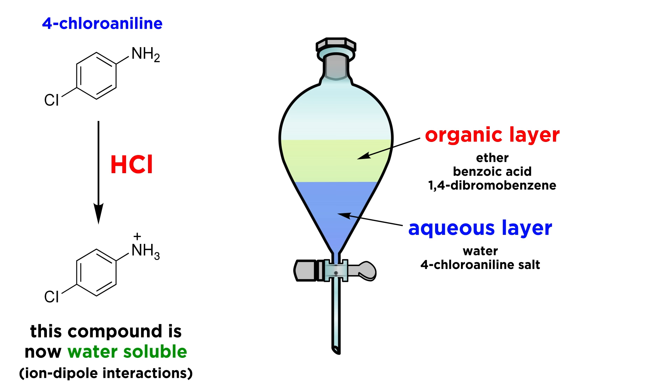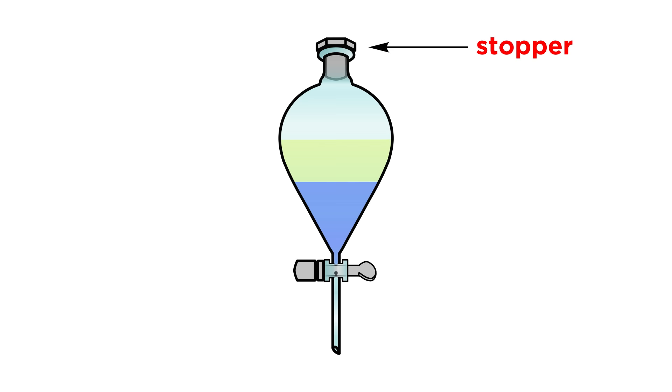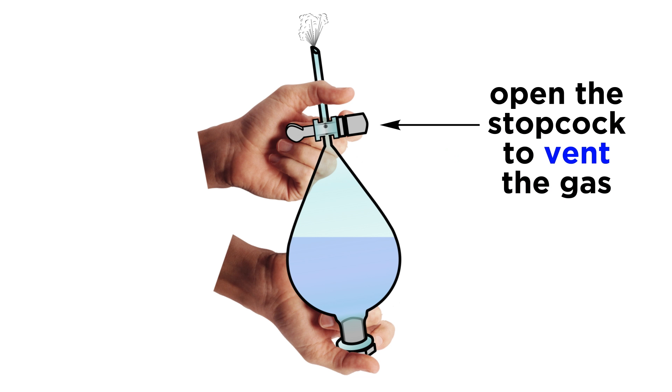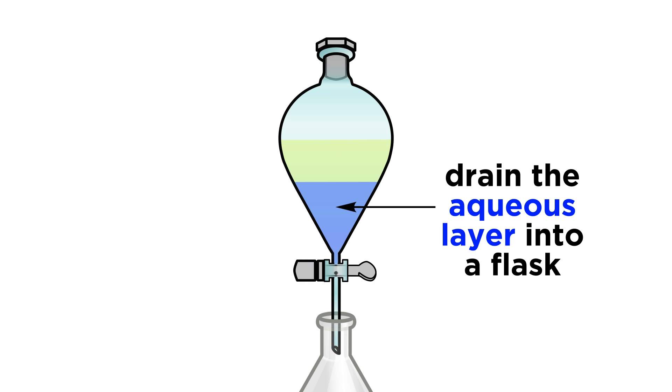Just to make sure everything reacts properly, we will put a stopper over the funnel, pick it up, and shake it around a bit. This will generate some pressure inside the funnel, so we will have to periodically vent by holding it upside down with a finger on the stopper, and turning the stopcock to release the gas that builds up. This will produce an audible sound. Then close the stopcock, and shake some more, and then vent again. You can keep doing this until the venting doesn't make any more noise, then you know it's done.